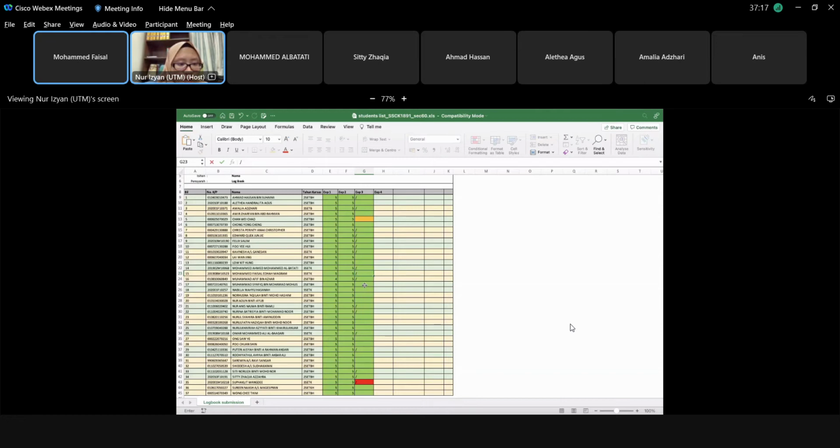Okay, Muhammad Shafiq. Yes. Okay. Can you mention the formula for the dilution? The formula that you will be using for the dilution from the stock when you have a higher concentration in your stock solution and you want to prepare another concentration which is much more diluted than the stock solution.